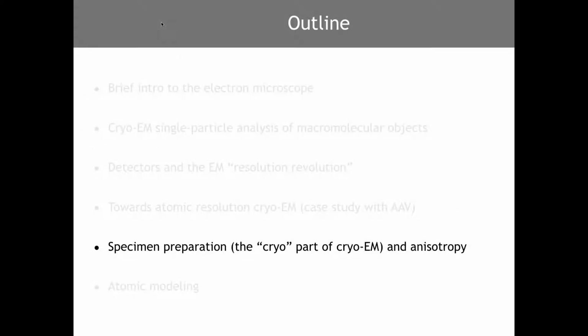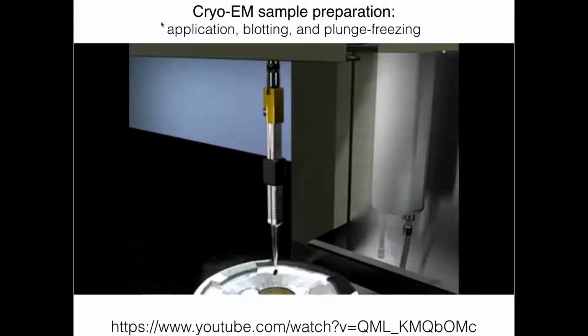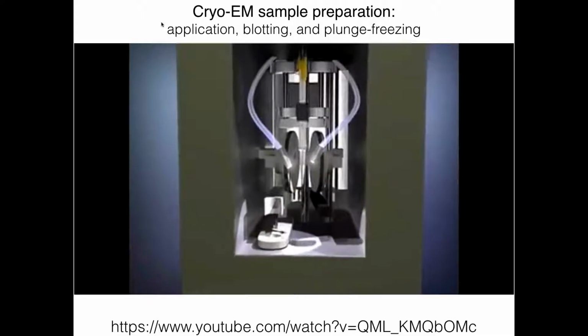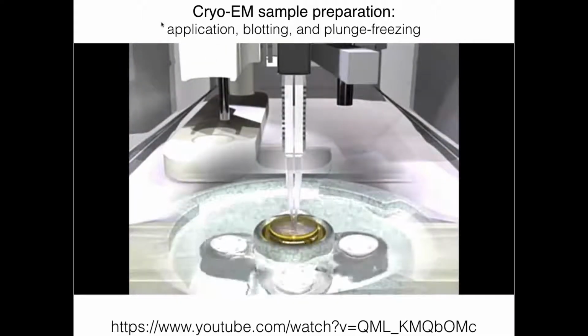So, okay, I will talk about this just to introduce the problem that specimen preparation remains a very major problem in cryo-EM, and there are ways to deal with it. This is how we make our specimens. We apply a sample onto this grid that we hold in tweezers, and then we blot out excess sample and plunge freeze it into liquid ethane.